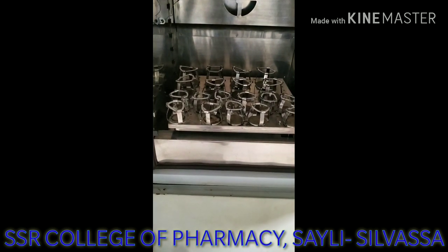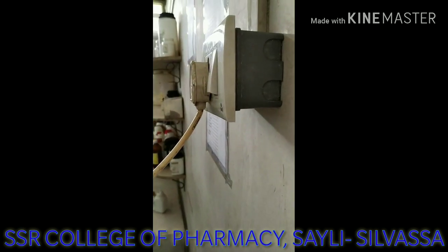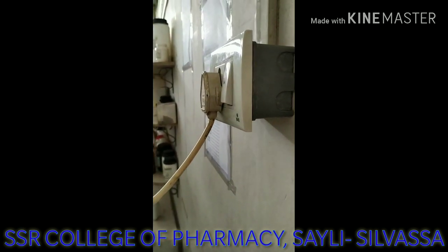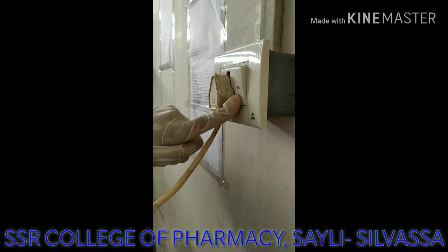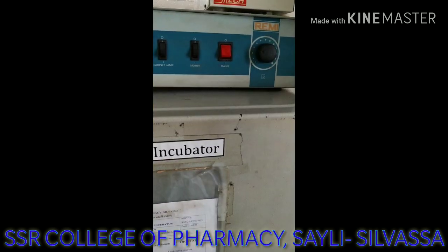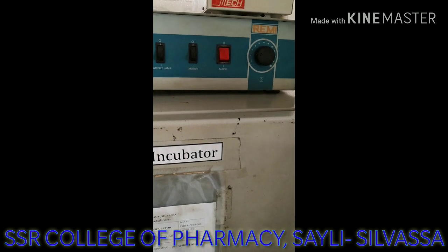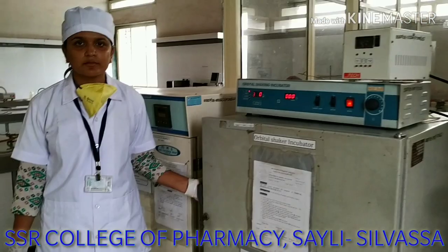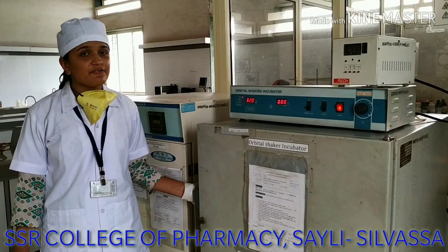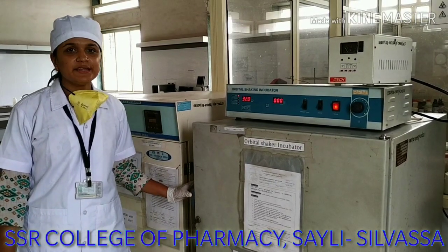The refrigerator is placed in the bottom. Now let us move towards the operation procedure. For that, first we will have to switch on the main power supply. After switching on the main power supply, we shall switch on the button of the instrument. After switching on the mains of the instrument, we shall open the outer door of the incubator.